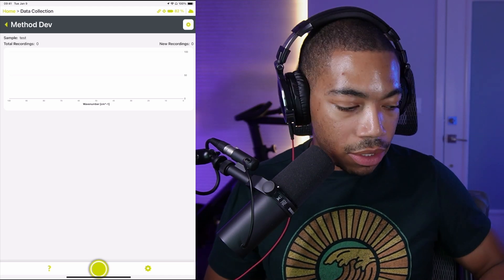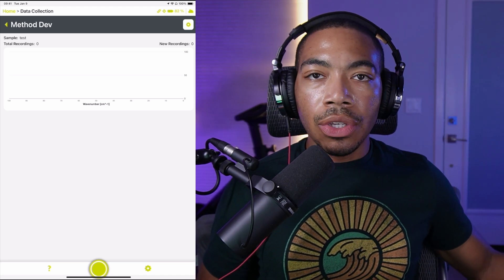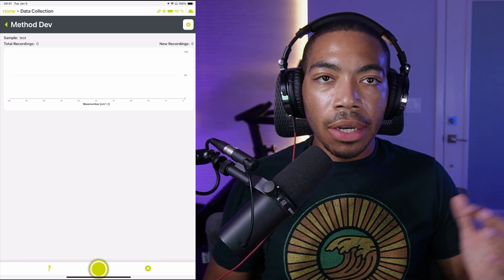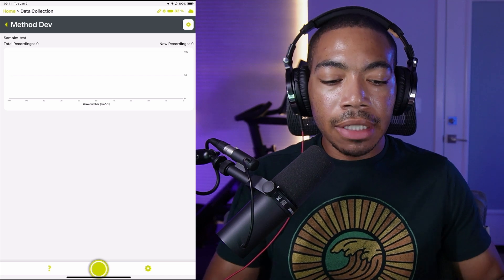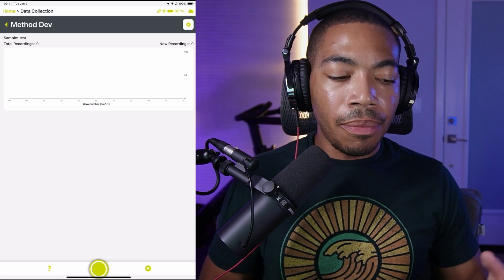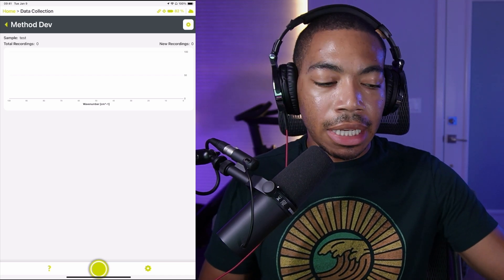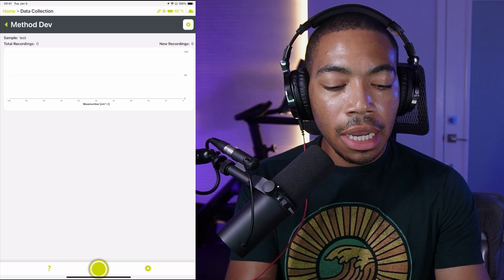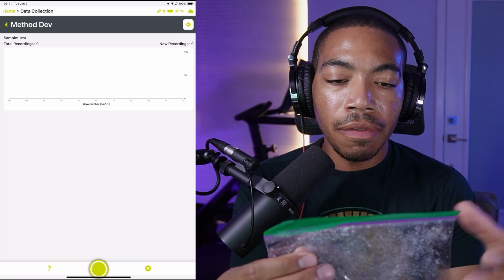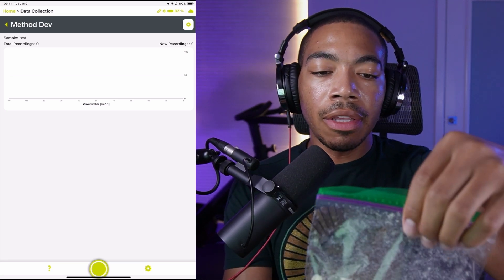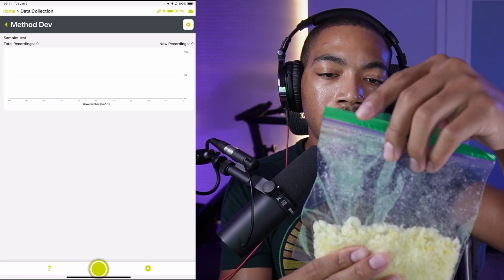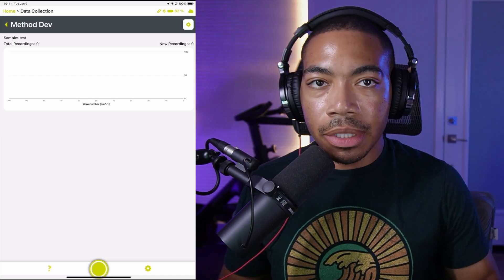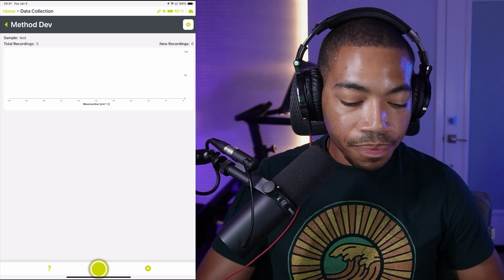The instrument runs the rest of the calibration sequence and just like that it's recalibrated — the warning has gone away. Usually before I start a new project, both in the real world and for projects on this channel, I do some method development work. I want to get an idea of the type of data I should expect from the various materials. This can give you an idea of how many samples you might need to see significant differences, and what type of matrix interference could come into play.